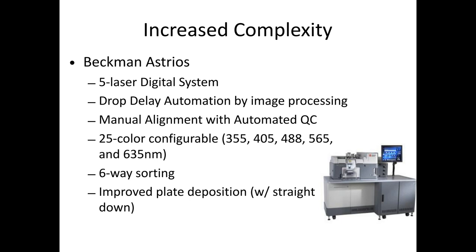But the thing I liked most about these 2 systems and the MoFlo before it was the improved plate deposition. It was a very smooth piece of engineering with really fine stepper motors that was very accurate. And that combined with sorting straight down, instead of sorting a deflected droplet. We instead would bend the entire waste stream to the right and just sort whatever we wanted straight down, made it super accurate. So we can start doing 384 well plates. This is really cool. So this is one of the features of this piece of instrumentation that was really useful in our hands in the core.